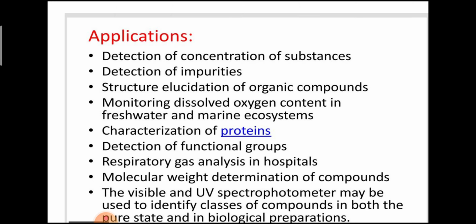So the applications of spectrophotometers: detection of concentration of substances, detection of impurities, structural elucidation of organic compounds, monitoring dissolved oxygen content in freshwater and marine ecosystems, characterization of proteins, detection of functional groups, respiratory gas analysis in hospitals, molecular weight determination of compounds.